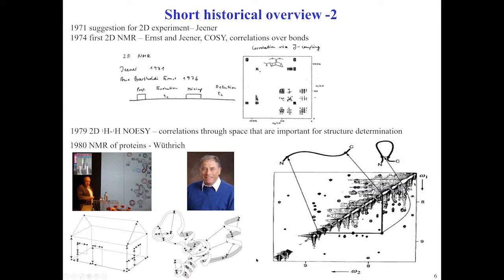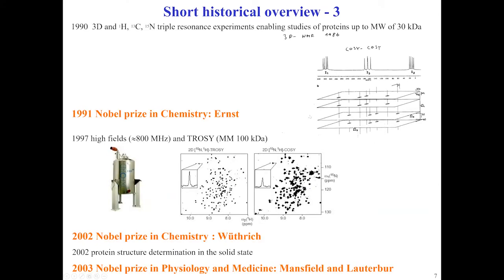The only little challenge is that for what we would call a small protein of 20 kilodaltons, which is reasonably sized, you'll have thousands of these. So there is absolutely no way to do it by hand to find a solution that fits all of them. But with computer tools that are nowadays available, you can do that. So things, of course, evolved.